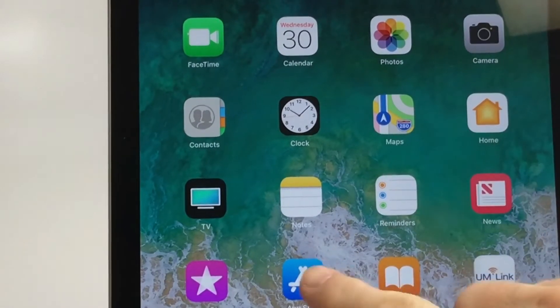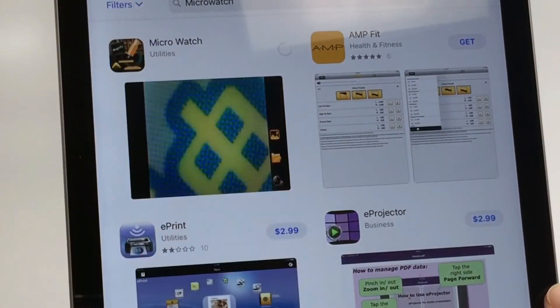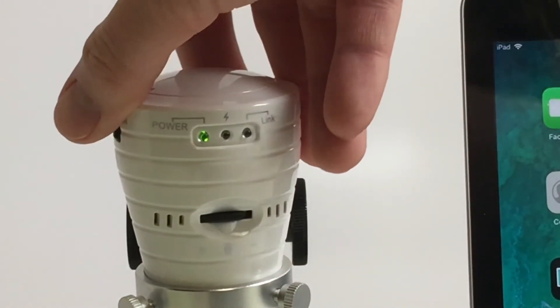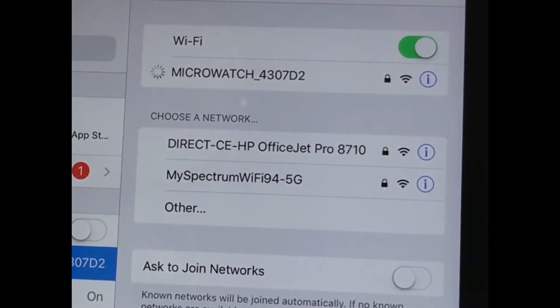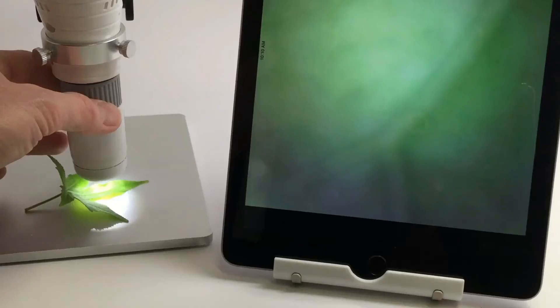For using the Vividia UM520 with your tablet or phone, first download the app from your App Store or Play Store. Next, turn the selector switch on your microscope to the on position to access the Wi-Fi setting. Go into your device's Wi-Fi settings, select the Wi-Fi signal transmitted from your microscope, then open your app to view.